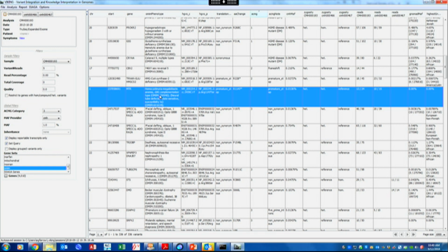So that's why the OMIM clinical synopsis is very handy. We use that a lot just to get a feel for, is this something that could be related? And you have to be careful, you want to have a little bit of leeway for broadening phenotypic spectrum or just an atypical patient that's not reading OMIM what they should be like. So if we go down, where is our gene? I'm not even seeing it in OMIM right now. That's all right. 193.